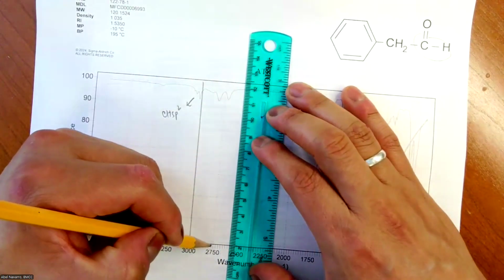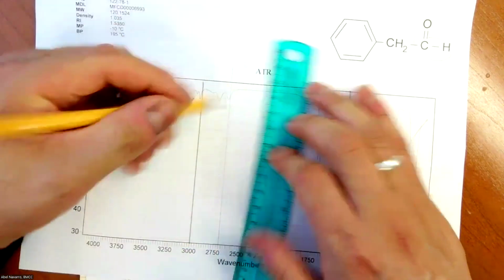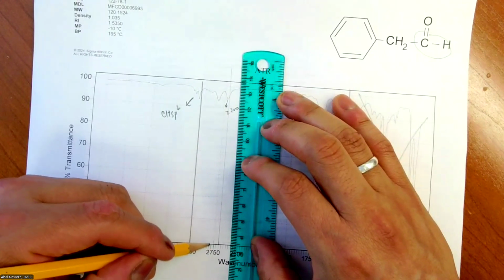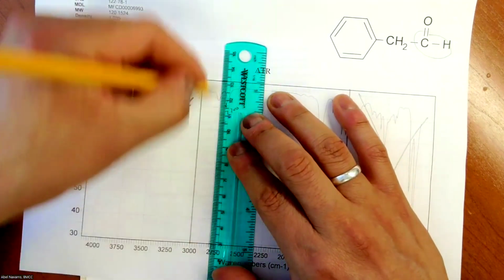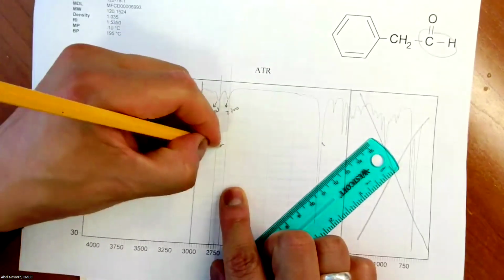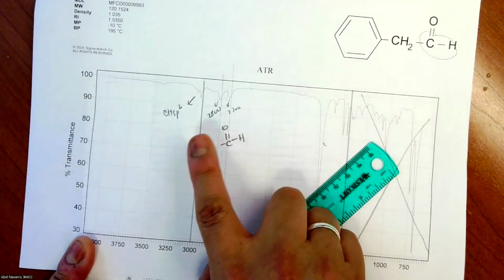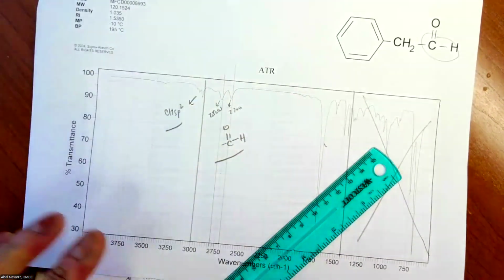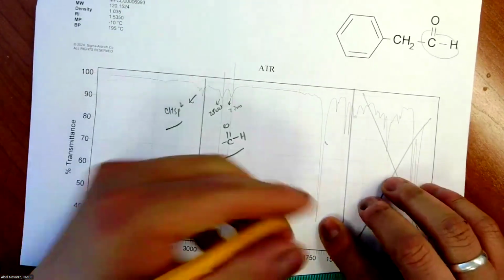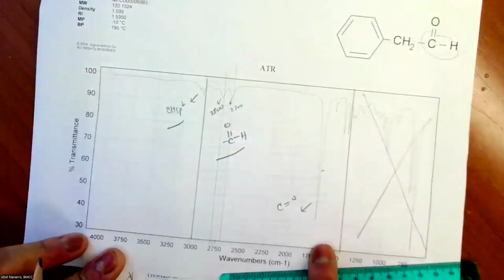This one is 2750, this is in the 2700s, and this one is 2800. That's the CH aldehyde. How do I label the CH aldehyde? Like this. That's how you do the assignment. It only makes sense to analyze those peaks if you have a C=O. This one is a C=O, and this is telling you that you have a C=O.